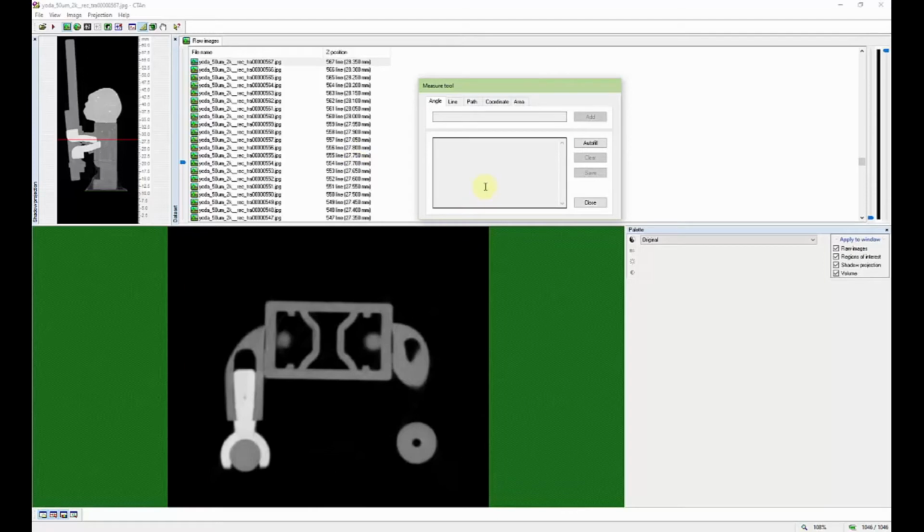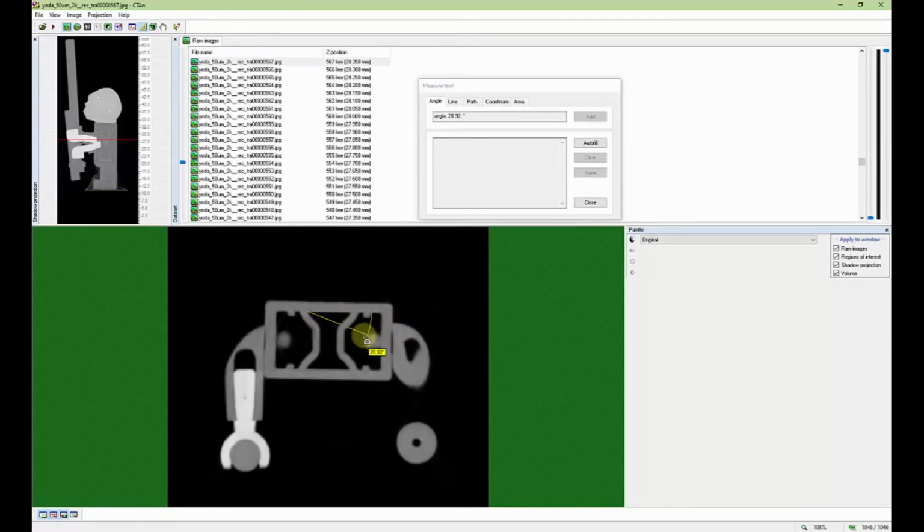Now, the last thing I'll talk about for the angular tool is that when you click, the horizontal plane, this direction, will always be the linear plane, and then the vertical can be adjusted to measure your angle. That's another thing you cannot change with this tool.